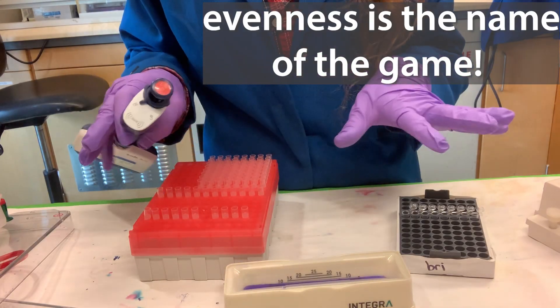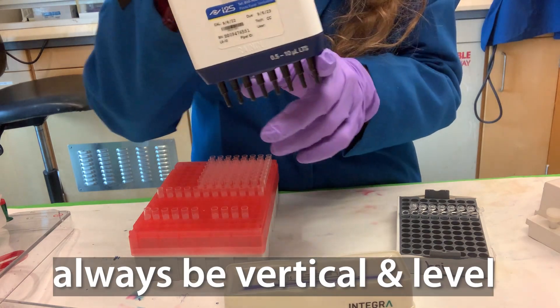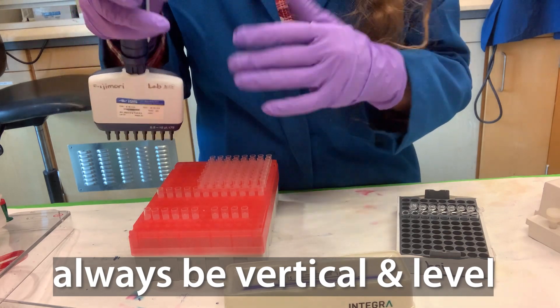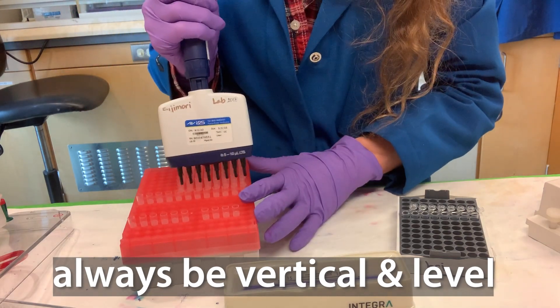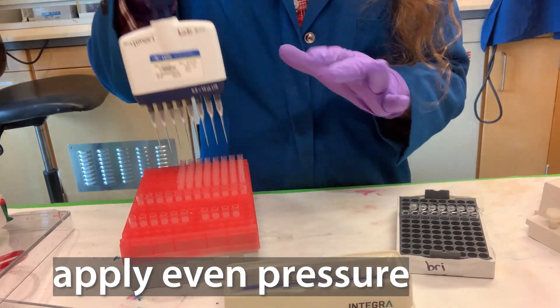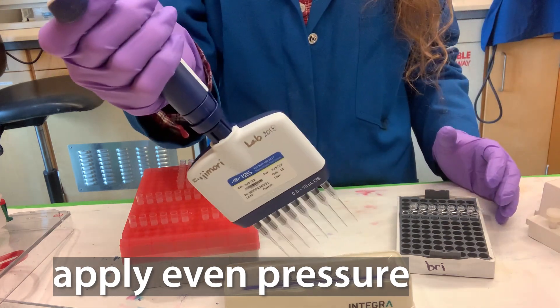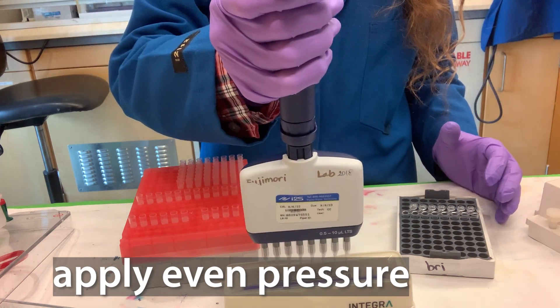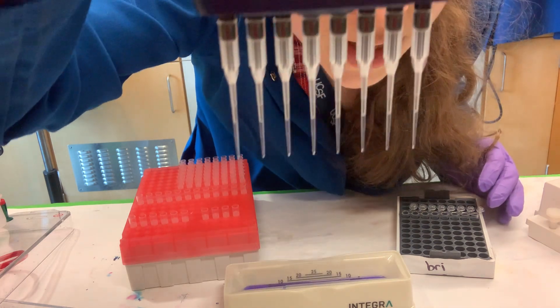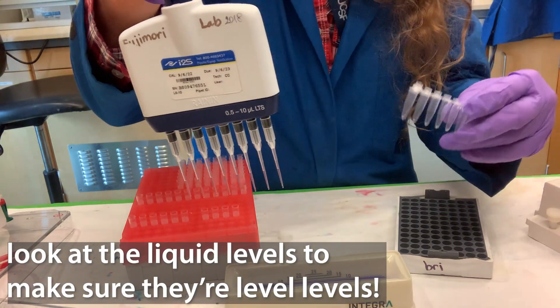When it comes to multi-channel pipetting, evenness is the name of the game. You want to make sure that the level of liquid in each of the different tips is exactly the same. To ensure this, when you pick up your tips you need to be vertically above them, applying even pressure — not too much, just enough. When you suck up the liquid, you're not doing it at an angle; you're straight above, vertically, just below the surface. Then visually check that the liquid levels are the same in each tip.